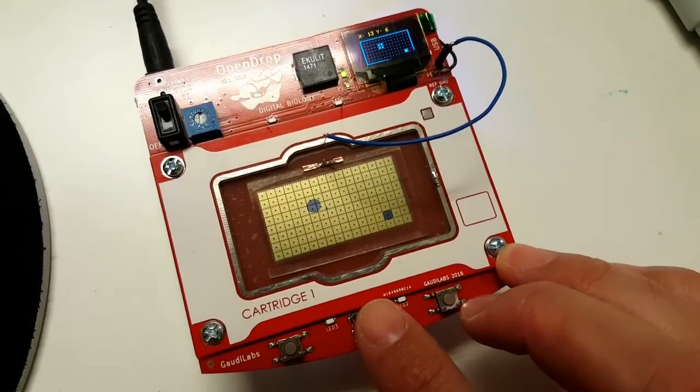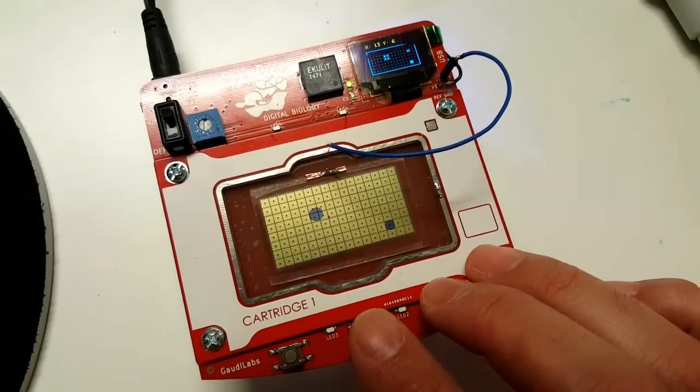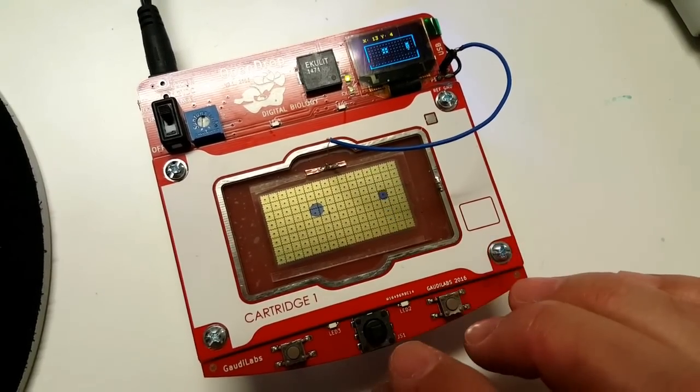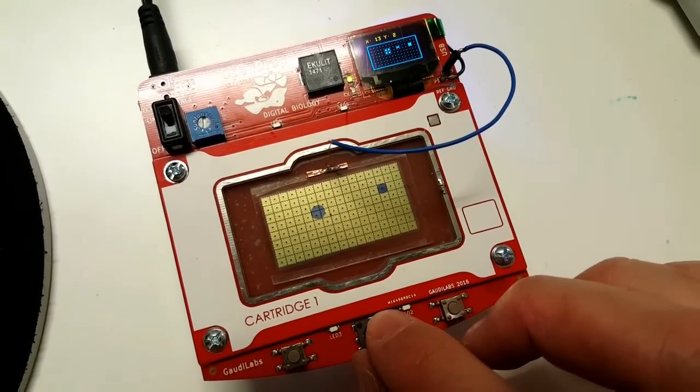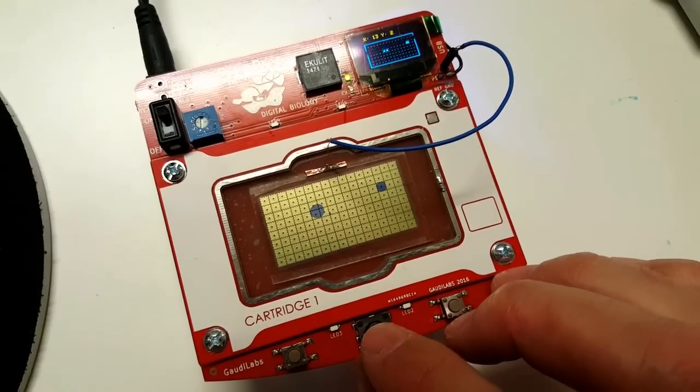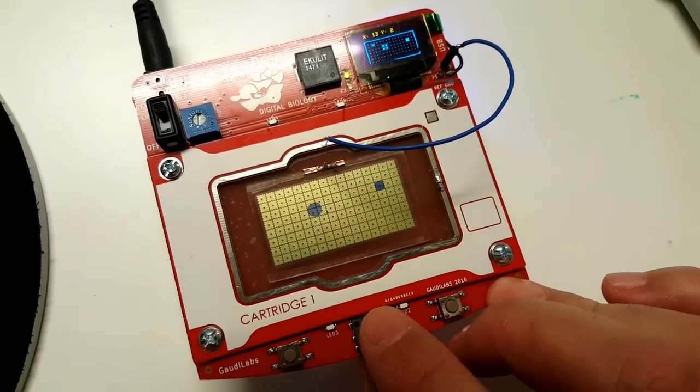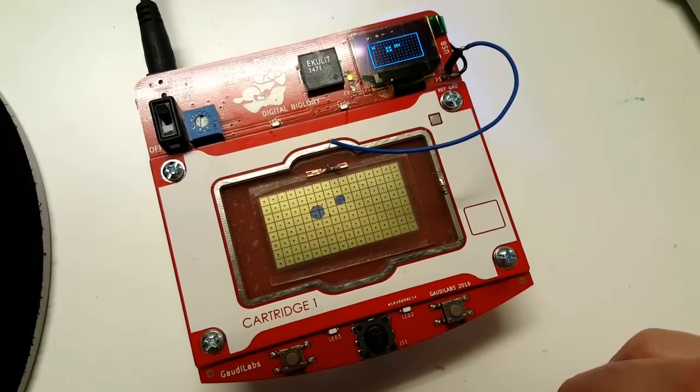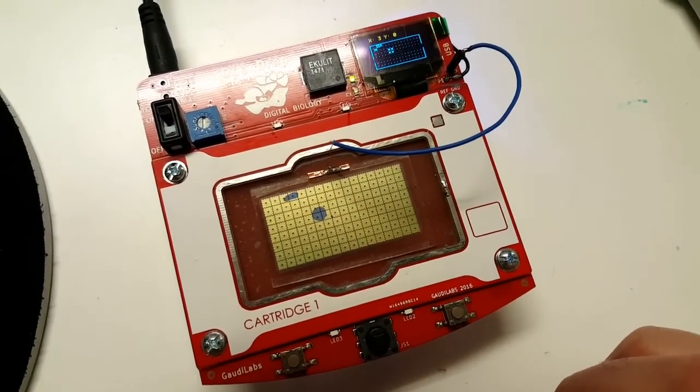With the joystick, I set a new goal, hit go, and the droplet will go there, avoiding other obstacles.